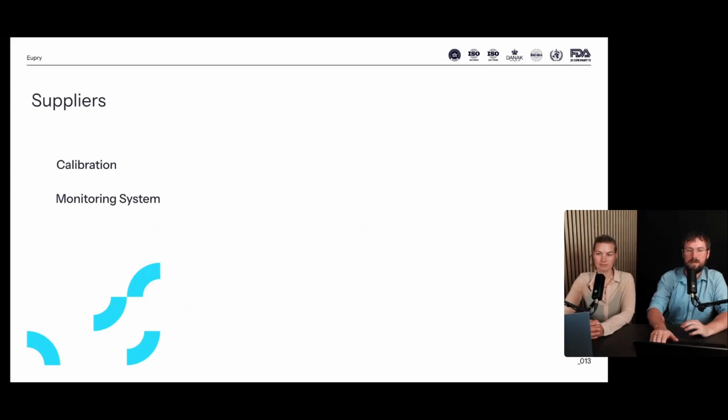So some great points in here from Francis. Thank you very much for being participative. So our firm asks ourselves the same: how badly do we need to calibrate beyond the acceptable range, and how far beyond? Exactly. I would say we often tend to get this question: how should I calibrate? But it's really up to yourself and your process. But of course, we'd love to help.